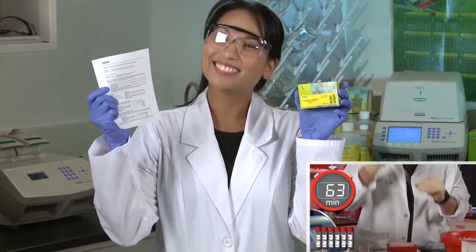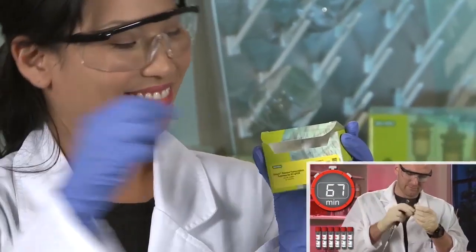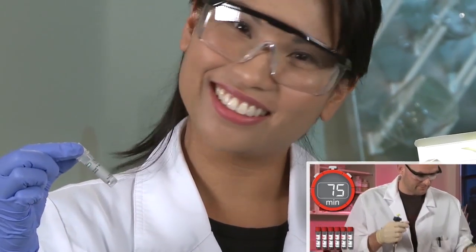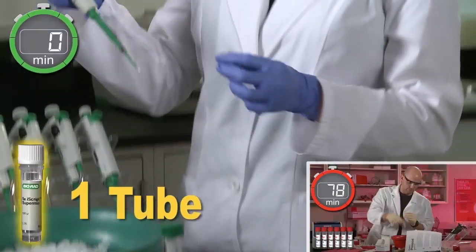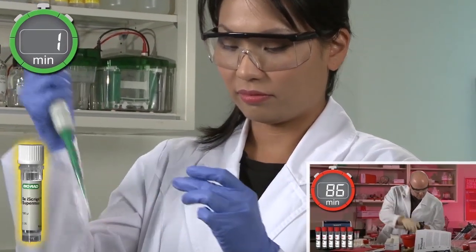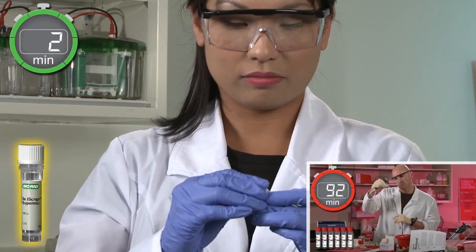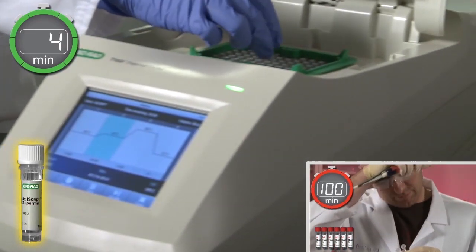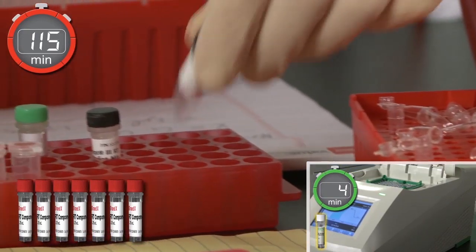Meanwhile, on the left, Karen will try BioRad's ready-to-use iScript SuperMix. With BioRad's revolutionary single-tube protocol, Karen can relax, knowing this simple one-step process will synthesize fuller-length unbiased cDNA.